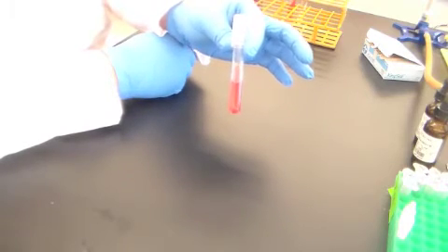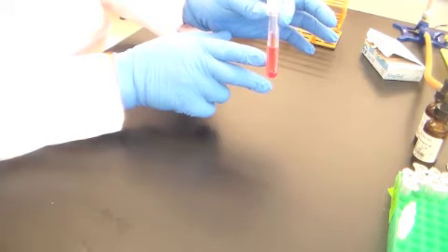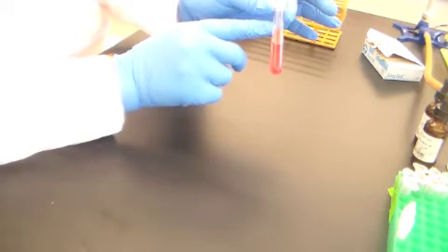Okay. So the other tests that you did in week 5 while you were in the laboratory, how do we interpret them? None of the other tests that you did require the addition of any reagents. These are simple observational tests. So you inoculated several bacteria with media like this lactose tube broth. So this is an uninoculated lactose tube. It's at a neutral pH, so the pH indicator is right around kind of a reddish color, not bright red. And its Durham fermentation vial is filled with fluid and there are no gas bubbles.